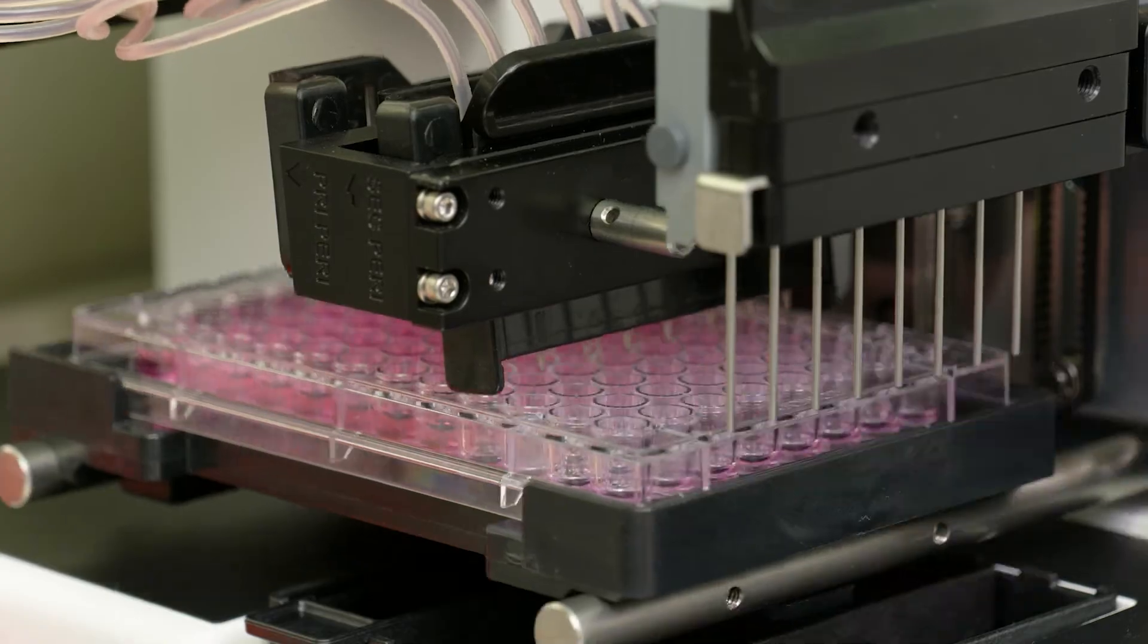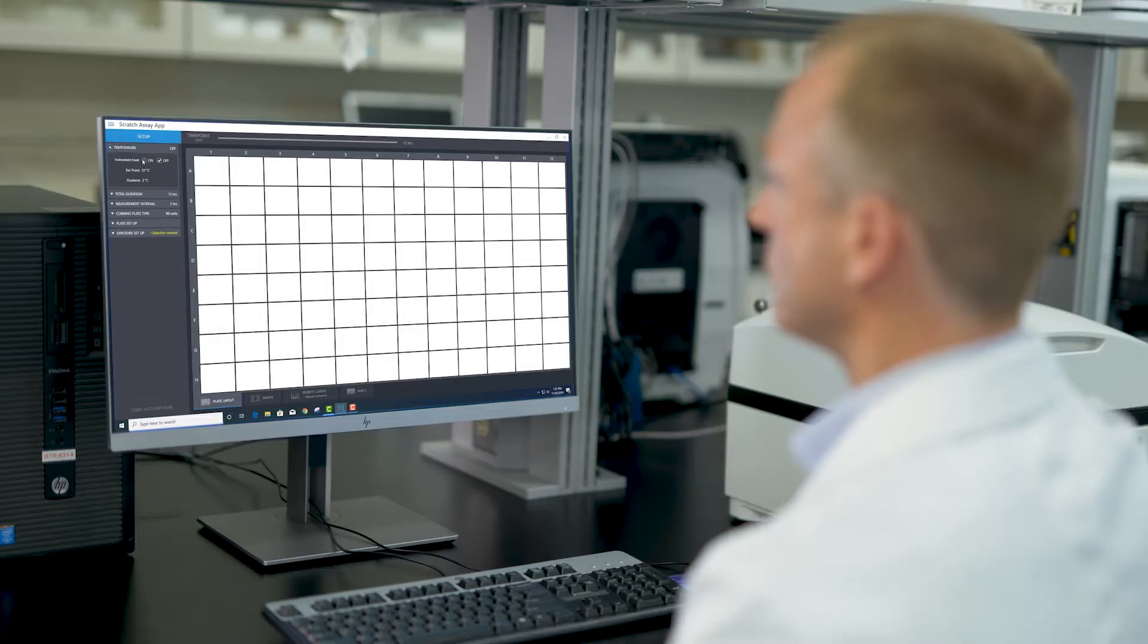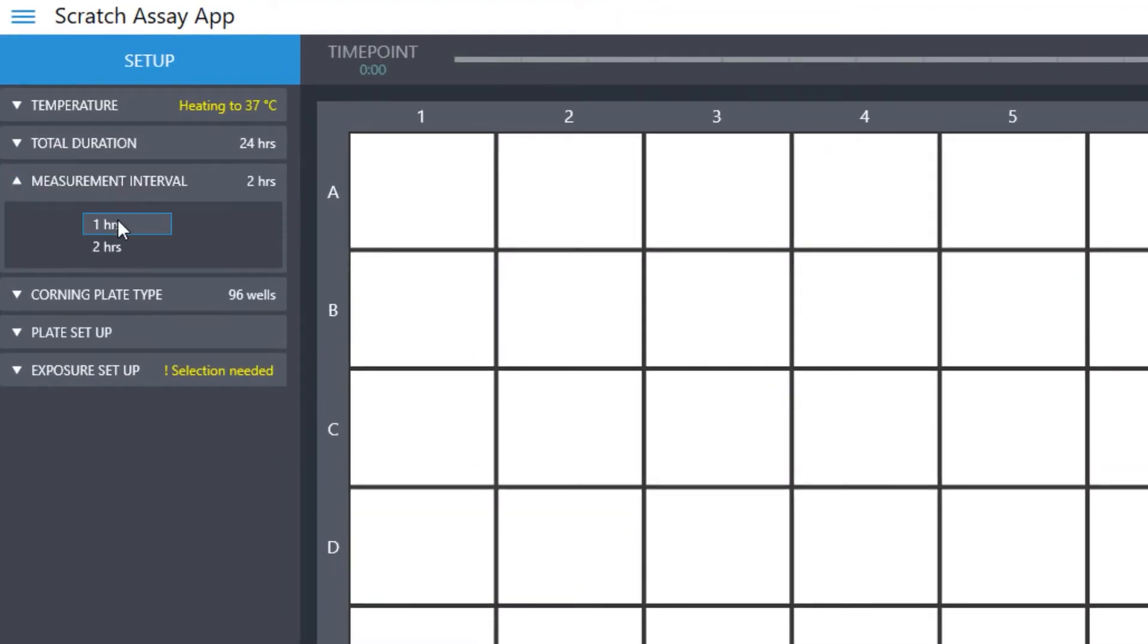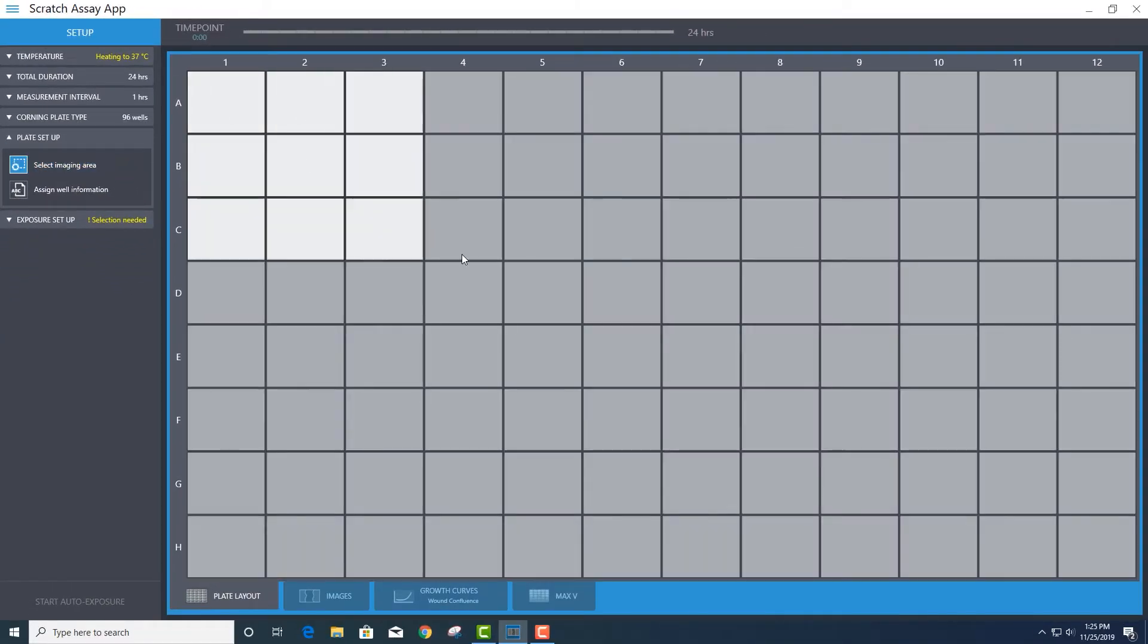After washing the scratches, the plate is moved to either the Lionheart FX or Citation for imaging. The Scratch Assay app offers a simple click-through workflow. The step-by-step assay setup is intuitive and quick. Select a predefined protocol or customize settings for your assay.